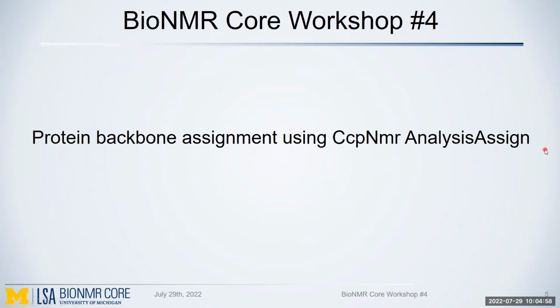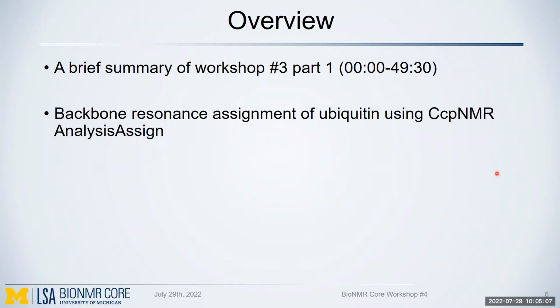And now let's move on to our topic today, protein backbone assignment using CCPNMR AnalysisAssign. There will be two parts in our workshop. First, we'll briefly go over workshop number 3, and we'll focus on part 1 of the workshop, in which Deb introduced the protein backbone 3D NMR experiments. And then we'll move on to a hands-on session where I'll show you how to do the backbone assignment using CCPNMR AnalysisAssign.